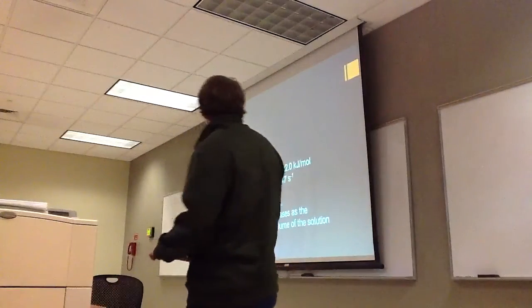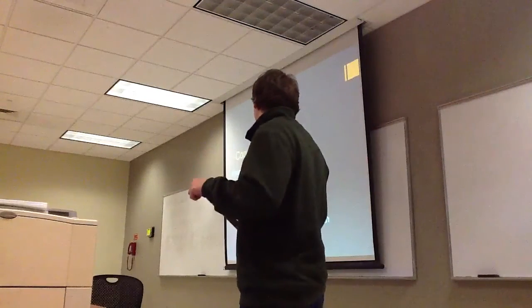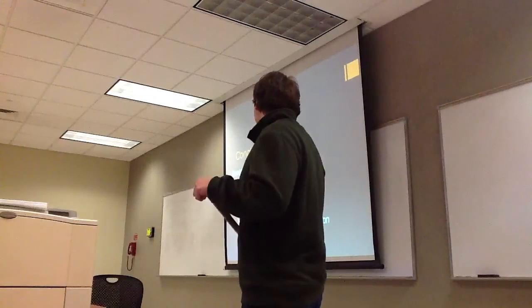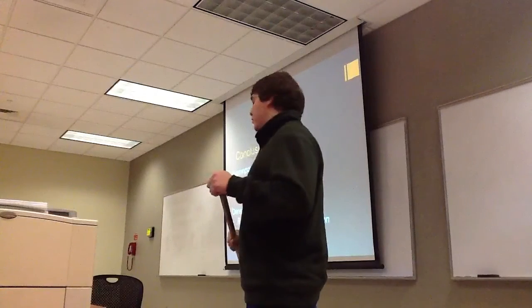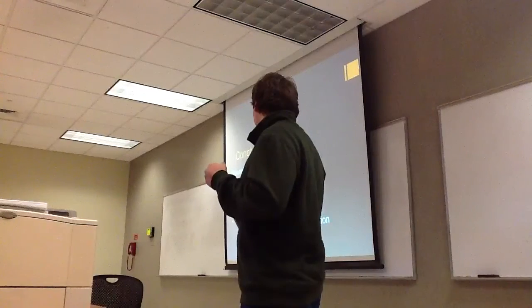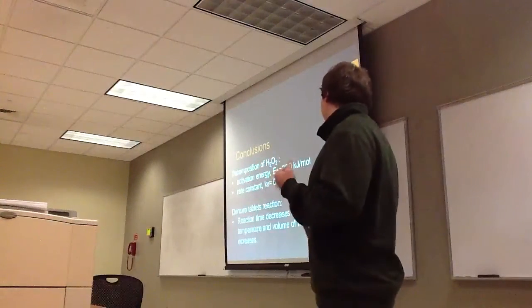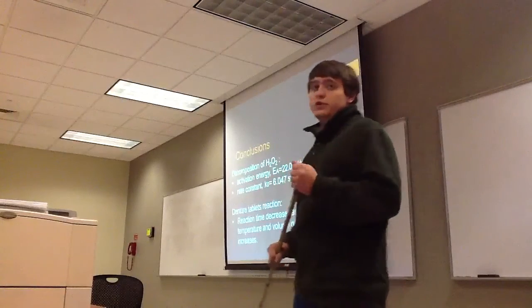The conclusions: the activation energy for that reaction of peroxide was 22 kilojoules per mole with a, I guess it's called a rate constant of 6.047 inverse seconds. The denture tablets reaction, what we found was that reaction time decreases as the temperature or the volume of the solution increases.